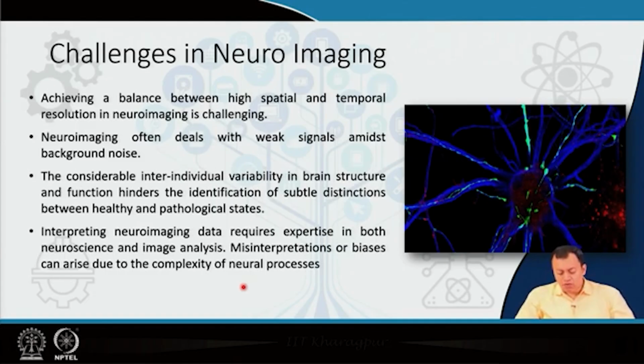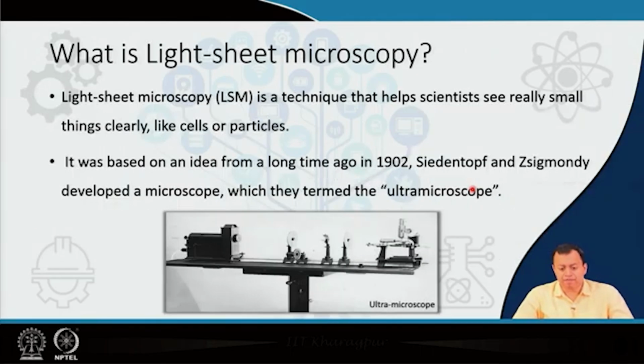But all of those methods were difficult, caused errors, gave weak signals, and it is very subjective regarding what you are looking at, and the small change in ions depending on the type of neural circuitry going on, what sort of electrical impulses, action potential has been given. So, it causes a huge amount of challenges that need to be overcome.